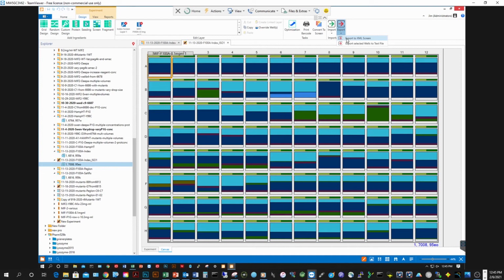So you have to consider certainly purchasing these new ISO screens as an added cost. And it's certainly worth it to get the initial hit and pass the bottleneck in the crystallization pipeline. Additionally, this new screen is not limited to the particular target at hand. It can be used as its own sparse matrix screen for other targets in the future in your laboratory, thus expanding future screenings.